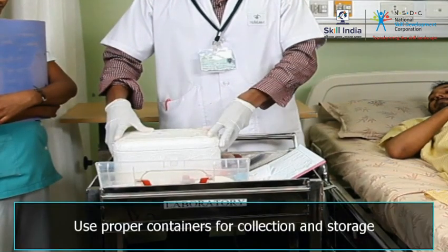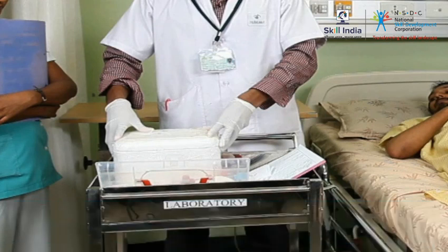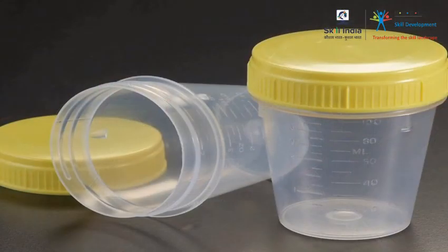Use proper containers for collection and storage. Using the wrong container often leads to erroneous results. Do not freeze specimens in glass tubes. Always use plastic containers.